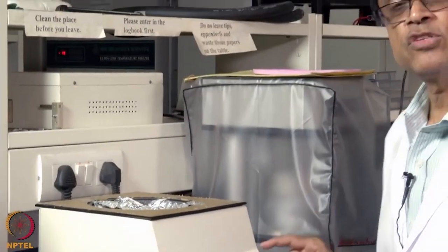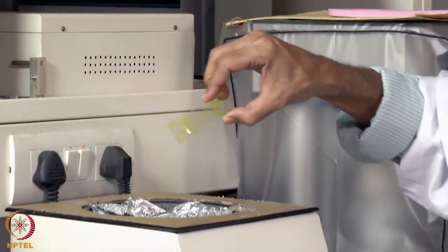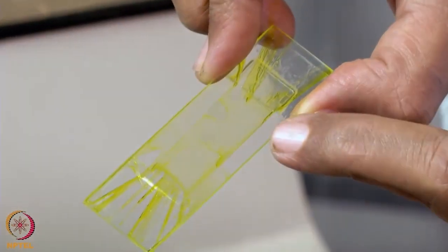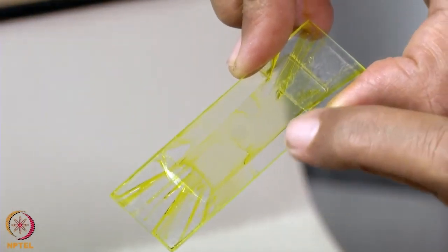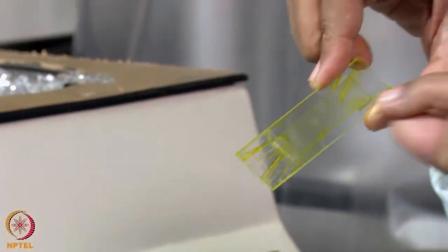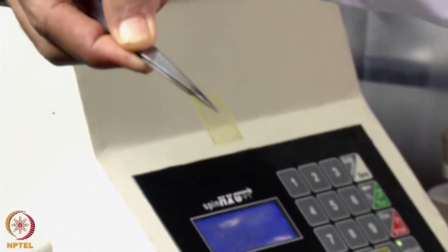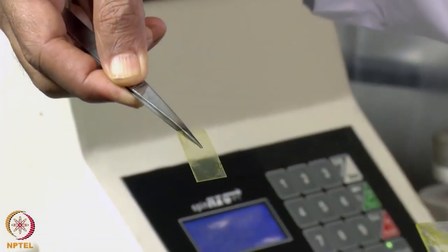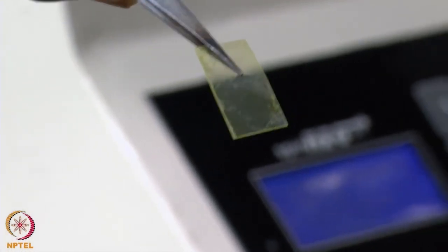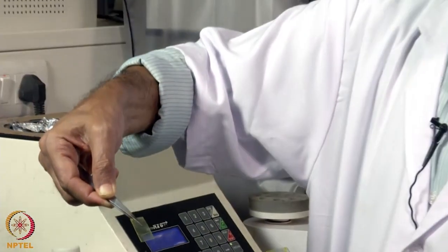Once the coating has been done, we switch off and stop the program, then remove the glass slide. As you can see, the curcumin and PVP mixed material has been well coated on this polyester, and now we can peel out the polymer from the glass slide. This is the polyester coated with PVP and curcumin, so it will have antibacterial activity and can be used for preventing biofilm formation on polyester surfaces.